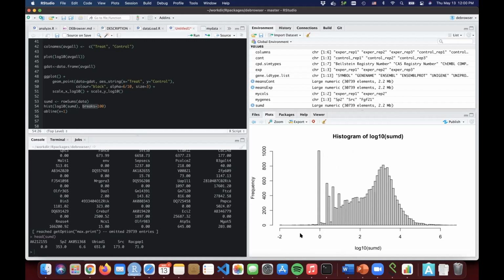So imagine when you do the correction on your p-values that we're going to talk about later. Imagine using 30,000 genes in your test versus 13,000 genes or 12,000 genes. There are many genes, 18,000 genes, that are 0. So you want to remove them. And then your adjusted p-value calculations will be more correct. And we are going to talk about what that is in the next session.